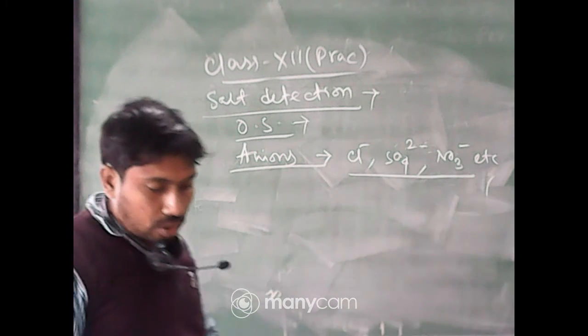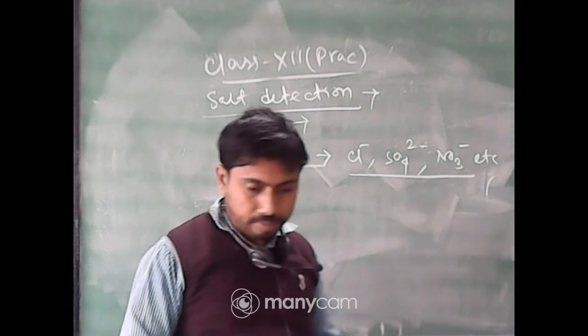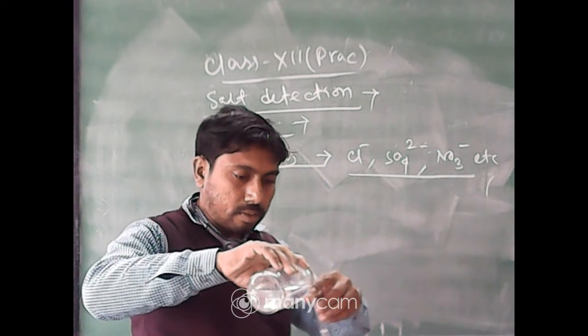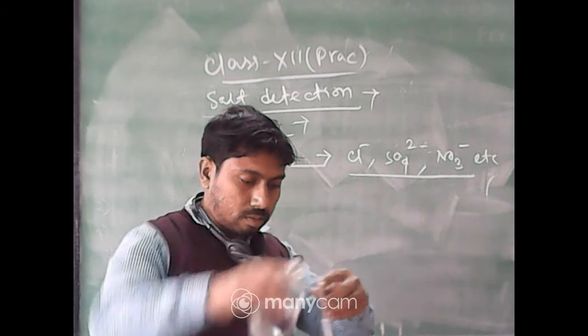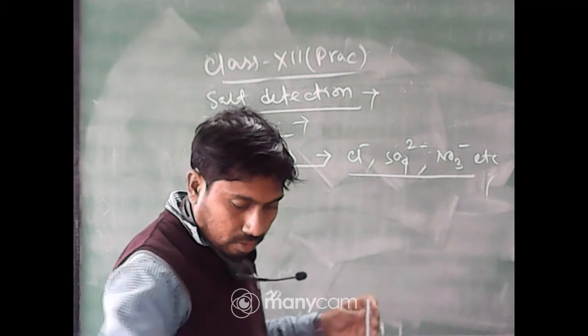So in this solution we will add ammonium chloride, and then ammonium hydroxide.